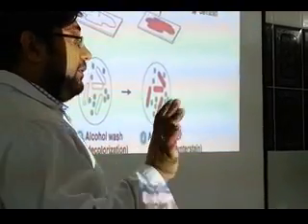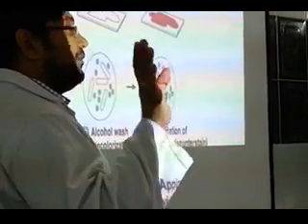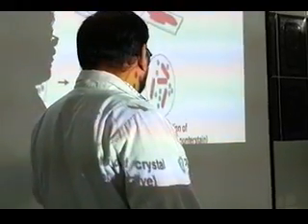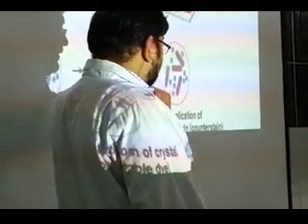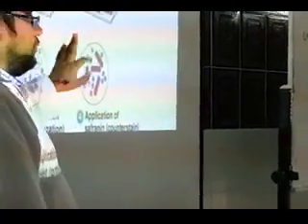It's fixed. Once the stain is in, whatever you do, it is not going out. It's like this, fixed. Okay, then you wash. It's not 30 seconds, not 1 minute, just 10-20 seconds you wash with acetone and then you wash with water. After every step you wash.